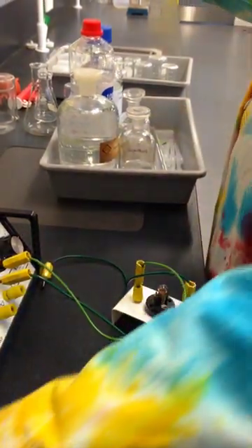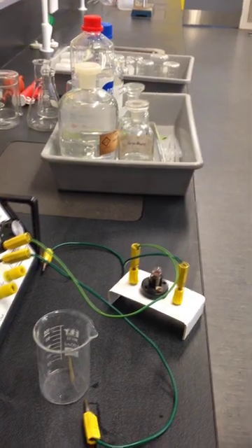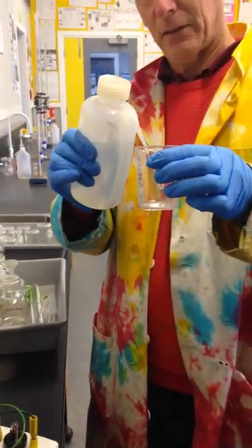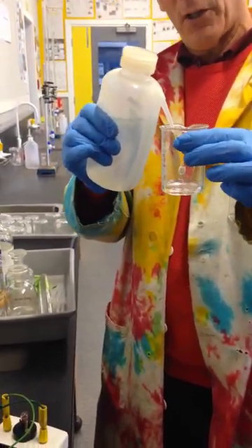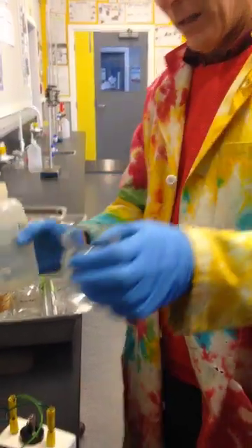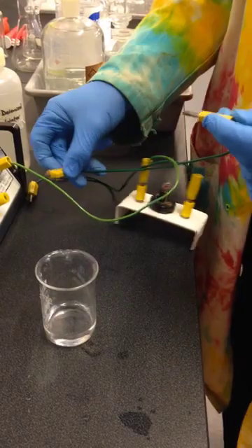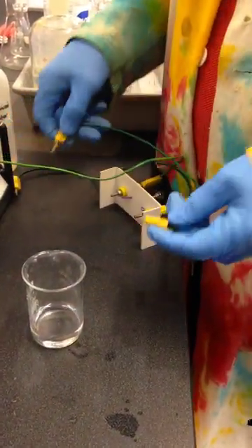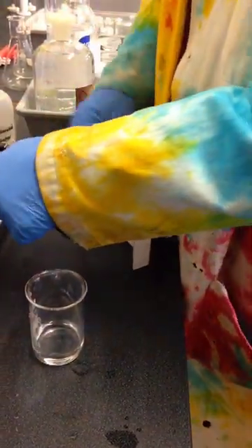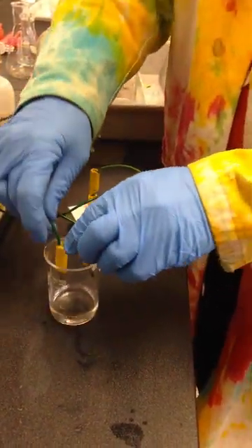But I am going to do the water. Now here's an interesting one. Water poses us lots of problems when we think about whether it's an electrical conductor or not. But contrary to popular opinion, this will not do what most people normally think it to do. So here's pure water. This is deionized water. Think about that, the fact that it is deionized water. What that means. And what might be the difference between the water that you drink at home and this.